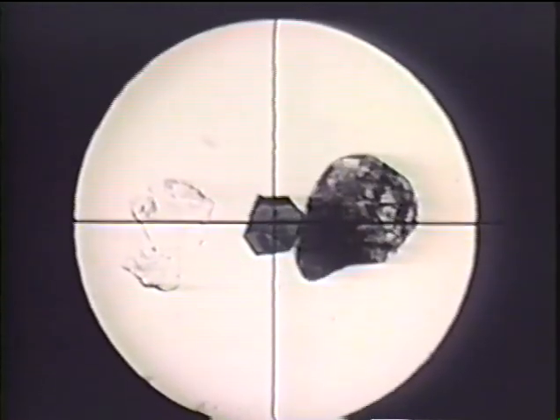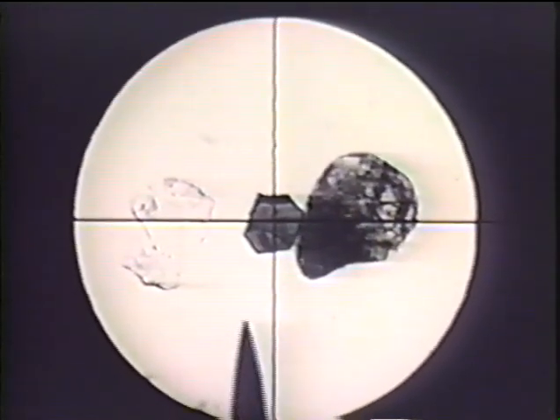Much may be learned from the shape of the grains. They may be crushed fragments of glass which are angular, or crystals like this piece of carborundum grinding powder, or sand grains which are worn and rounded. Crushed glass has a curved conchoidal fracture.